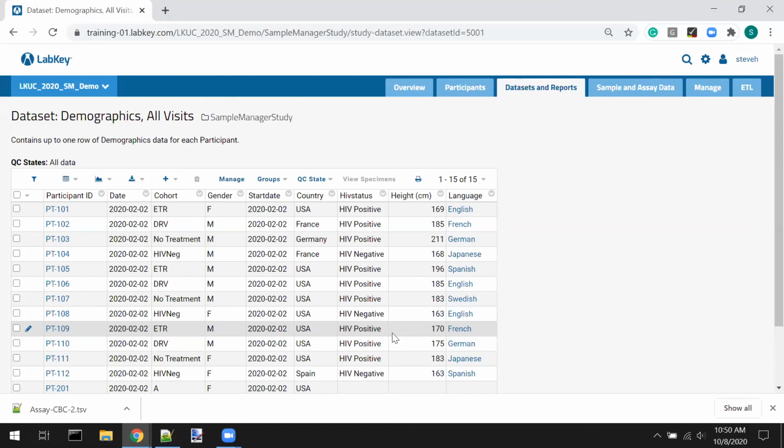We have one user asking whether LabKey can support microbiology data, such as organism identification and multiple drug minimum inhibitory concentration assays and drug therapy interpretations for each sample. My answer to that would be absolutely.